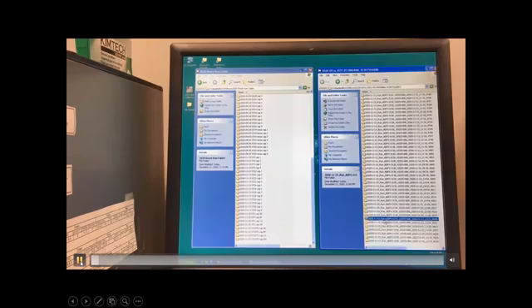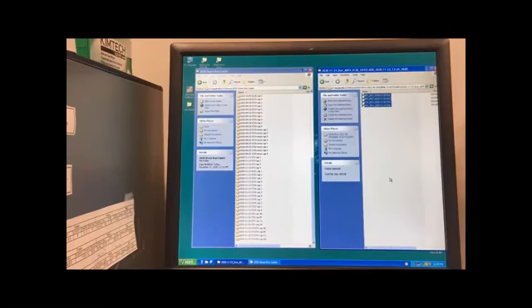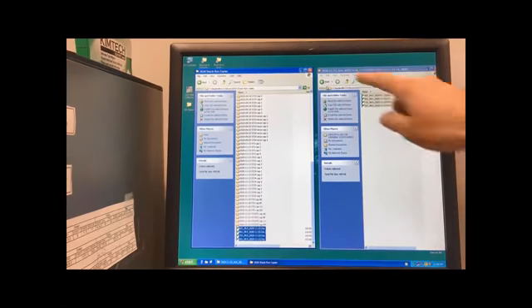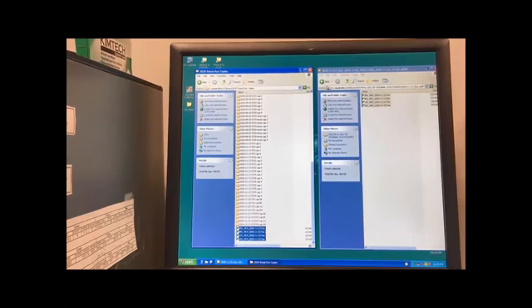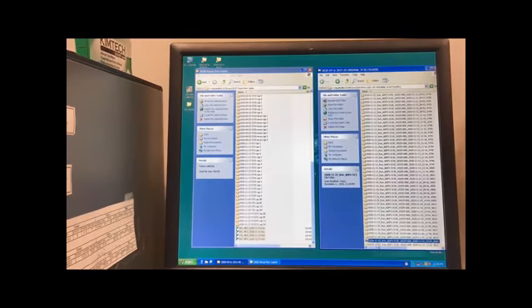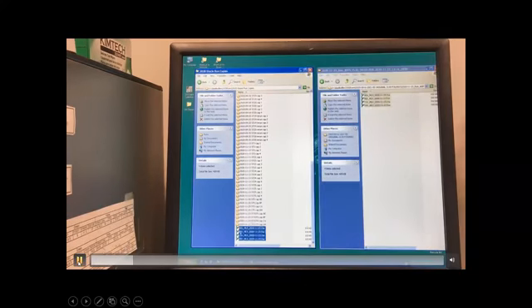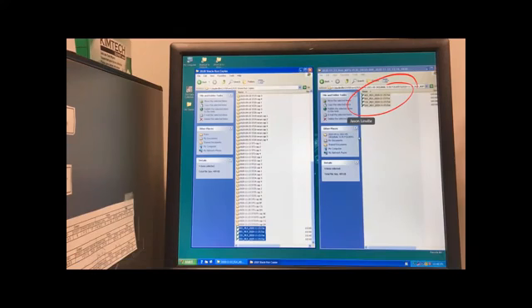Okay, I'm going to open this up. Okay, and I'm going to highlight all of them. What you can't see is I'm doing Control-C for copy, and I've copied them there. See, they're in the original folder still, okay, and they're also in that. Now, notice here, wait, I'm going to go back. Okay, so they're in the original folder, and there's copies of them down here.